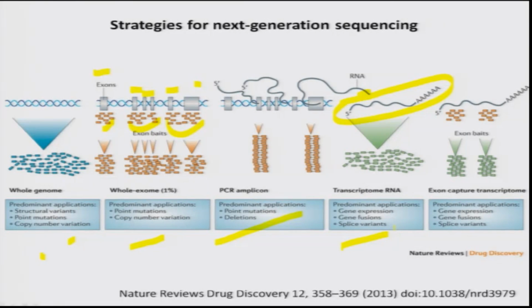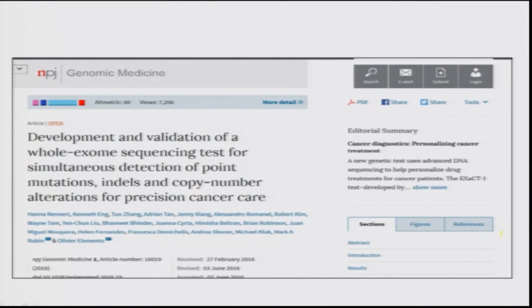of the gene. And you can also understand gene expression with regard to, for example, the splice variant. Remember we were discussing how the gene can undergo alternative splicing. With most microarrays, you have a limitation with regard to which splice variant of a gene you are looking at. But since you are sequencing here, and if you restrict your sequence analysis to exon-intron or exon-exon boundaries, you will be able to tell which spliced form is more abundant, which is less, right. That really helps us. So that is another big advantage of next generation sequencing.